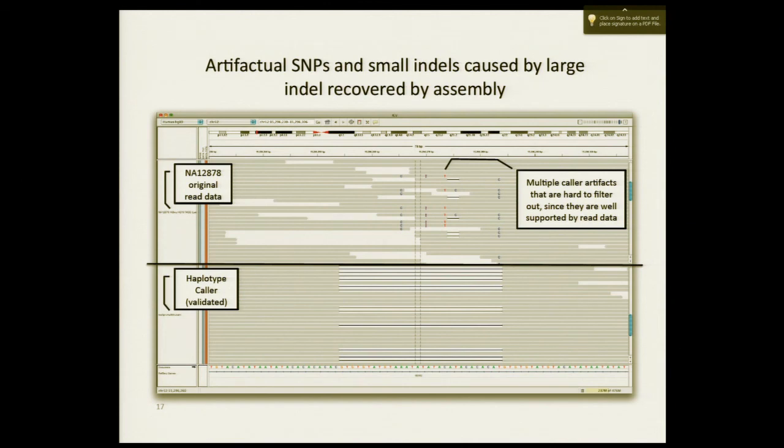I don't think it's going to allow it, because it uses this Smith-Waterman calculation, where for every deletion base you're adding more penalty, right? So you have a penalty for each deleted base. This is the gap continuation penalty. So you just sum up these penalties. And eventually your penalty is just so large that you say this is not likely to be real. And so having a few mismatches is more likely than having a bunch of continuation penalties. It's just the way the mathematics works out, that it's just not going to allow larger deletions. So it's just the length of the event that is the reason why.